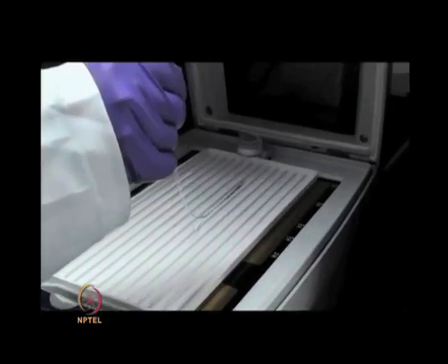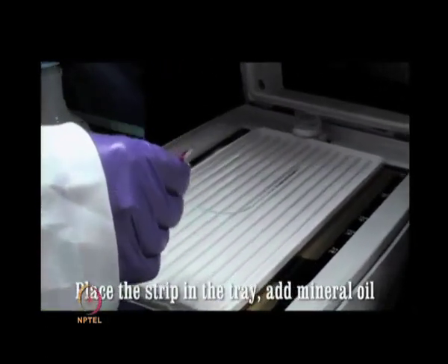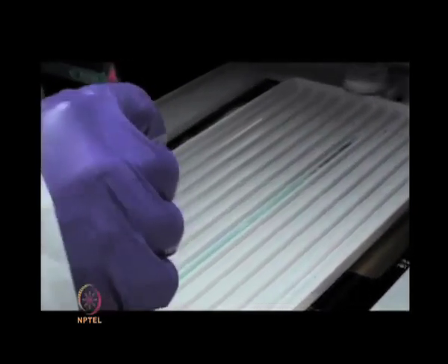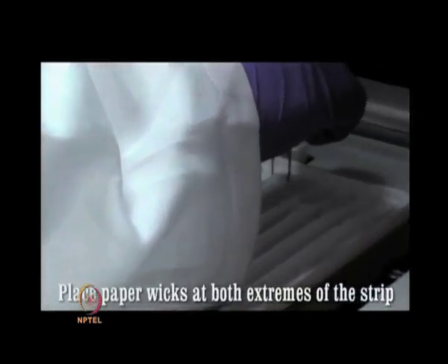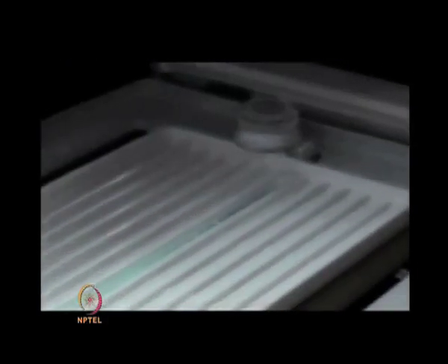Place the strip in the focusing tray and immerse it with mineral oil. Then place the two wicks at either end of the IPG strip, followed by an electrode at each end.